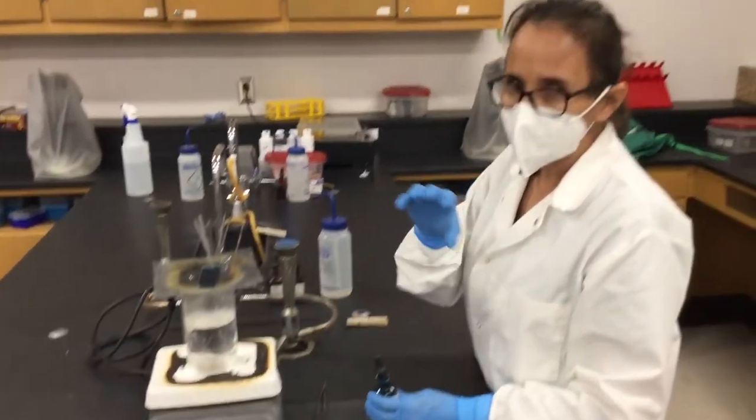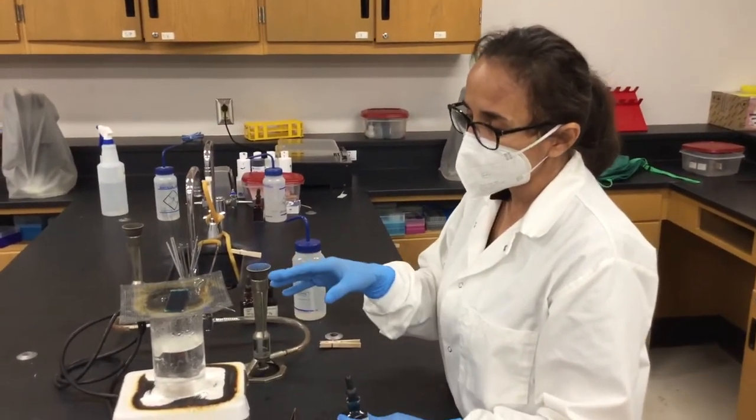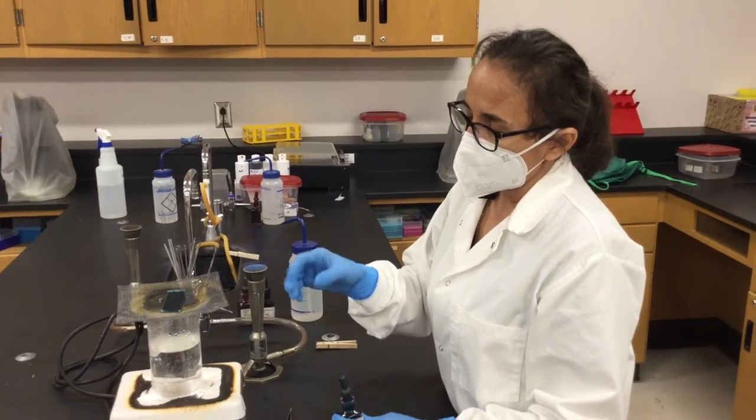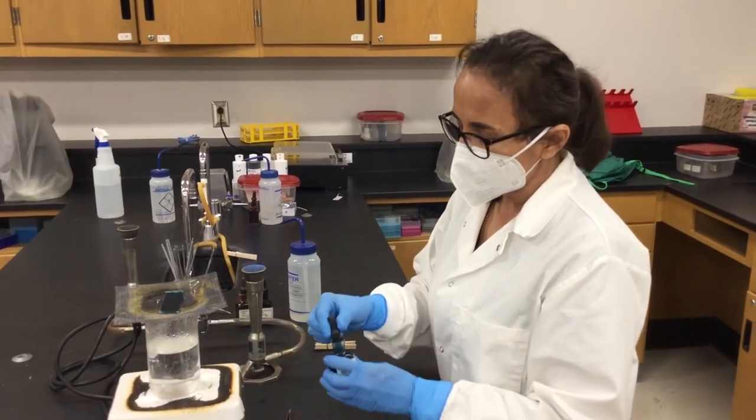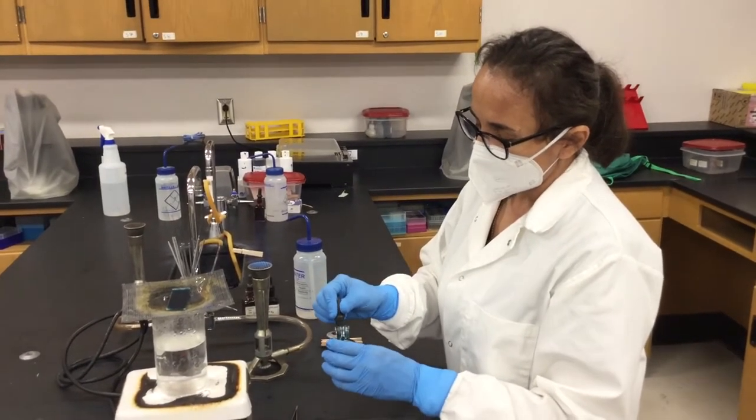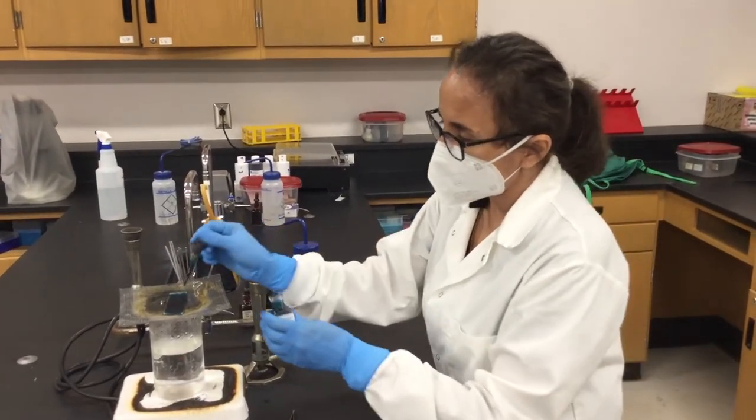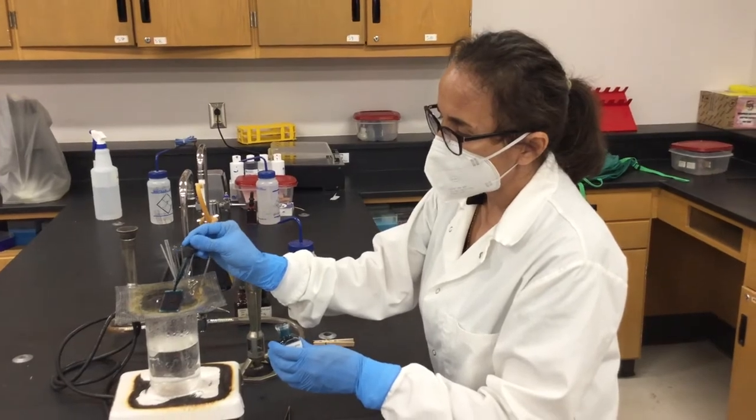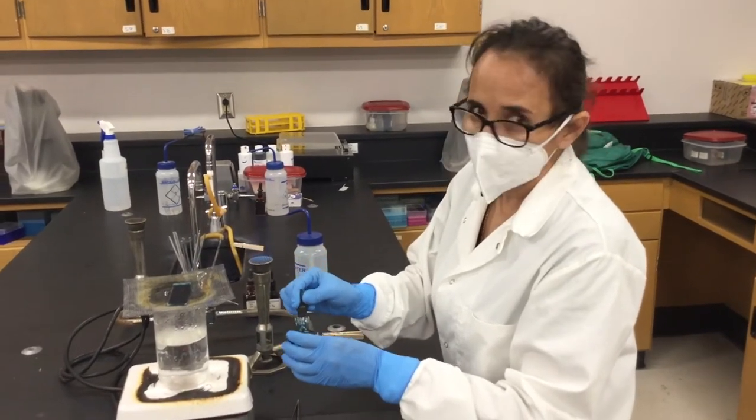Which is the kind of stain that is going to stain the cytoplasm of the cells that are having this vegetative form. So your endospore stain then will stain the endospores with green color and that vegetative form with red color from safranin.